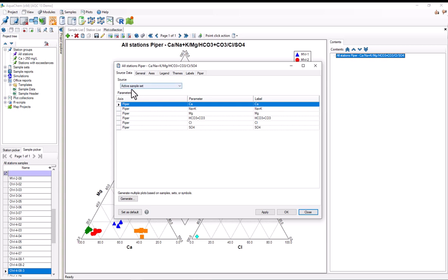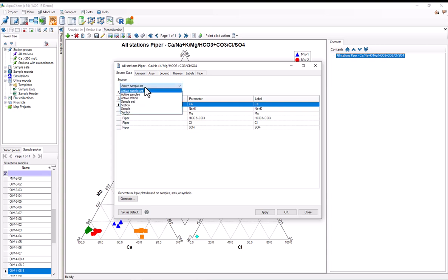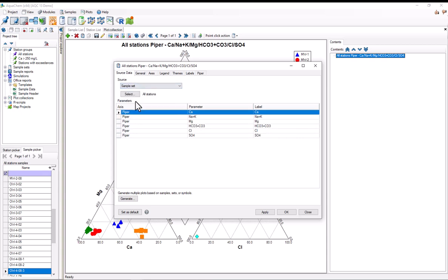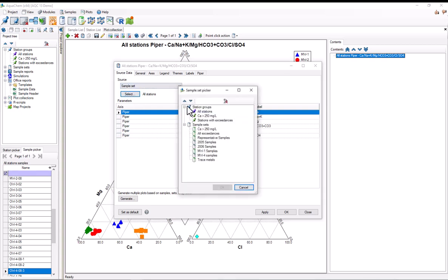Under source, we can see that this plot is currently using the active sample set, which happens to be the all-station sample set. If I wanted to, I could restrict where this data is coming from. For example, if I wanted the plot to only display from a particular sample set, I could open the dropdown and select Sample Set, and now I have the option to press Select and select which sample set to use. I'll choose the 2005 samples, which is a sample set for the samples taken in 2005.